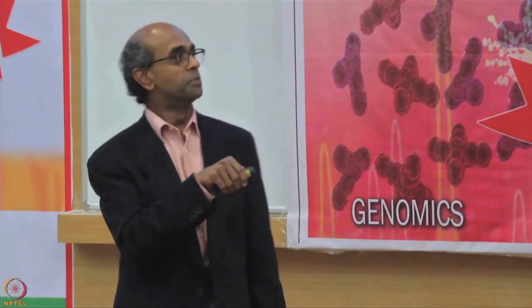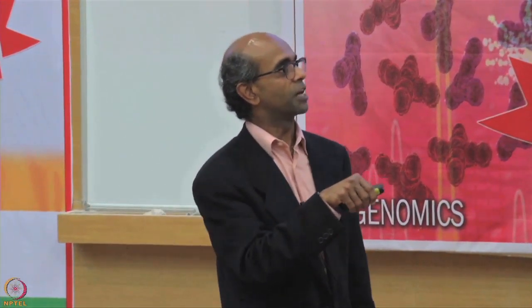So these things you have to be a little more careful. You can't just throw it away. But the most worrisome part is missing not at random. Unfortunately, most proteomics data is missing not at random. Missing not at random means the missing value depends on the missing data. In other words, it's missing when the value is some specific thing. If your intensity is less than some count, the data is missing. So that is missing not at random.